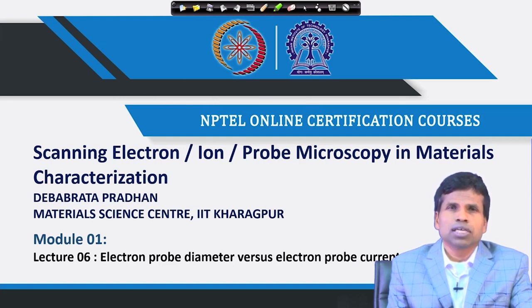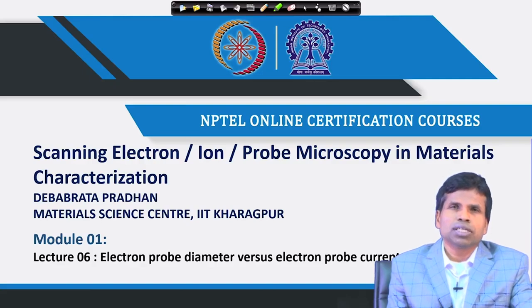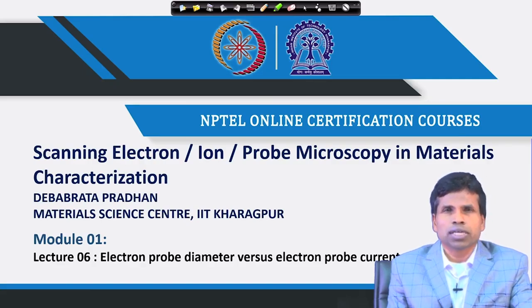So, when the electron beam is incident on the specimen, the size of that beam is almost 1 nanometer. Then we can collect the information from the 1 nanometer area, so our resolution can be as good as 1 nanometer. Now, if we are condensing the electron beam to a very fine beam, then certainly the number of electrons incident on the specimen will be less and less.